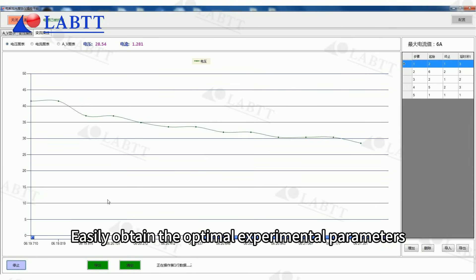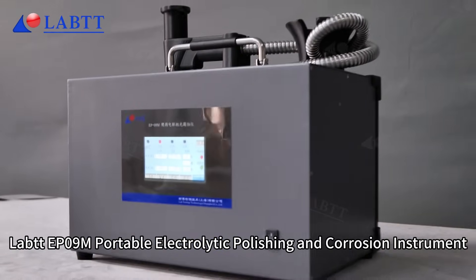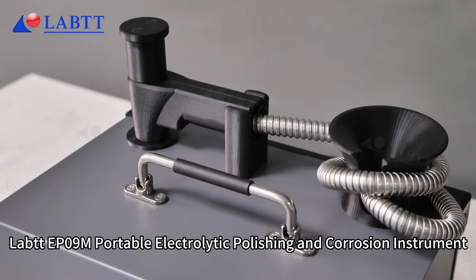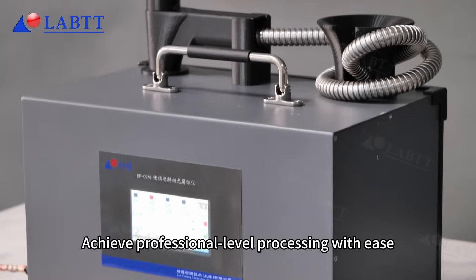Easily obtain the optimal experimental parameters. Labtt EP09M portable electrolytic polishing and corrosion instrument — achieve professional level processing with ease.